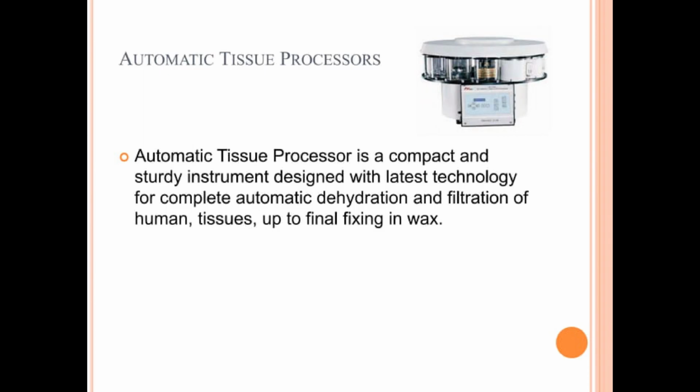Tissue transfer machines. Also known as dip and dunk machines, these processors move specimens from one container to another for processing. Fluid transfer machines. Also known as enclosed machines, these processors hold specimens in a single chamber and pump fluids in and out. Modern fluid transfer processors use raised temperatures, vacuum/pressure cycles, and effective fluid circulation to reduce processing times.